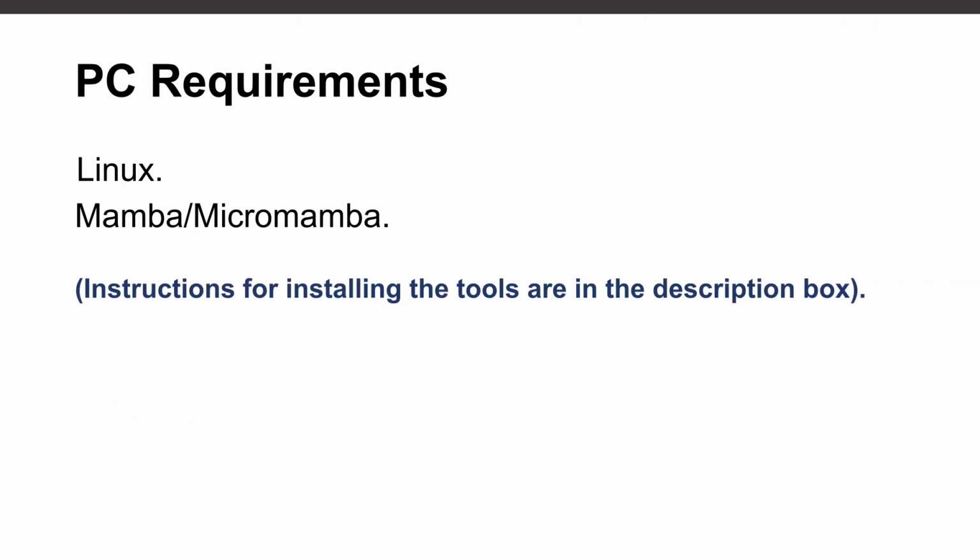And so with this tutorial, if you are going to follow it, you need to make sure you have a Linux system, and you should also have Mamba installed. We are going to use Mamba to install everything. I have a tutorial that shows how to install Mamba on a Linux system, so check the description box. You find the link to that video. Now let's proceed. Let's open our terminal and then start the exercise.